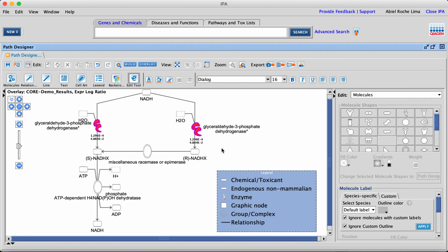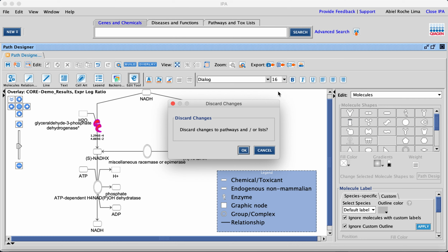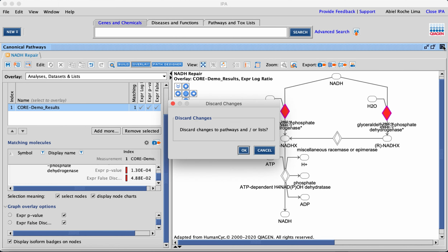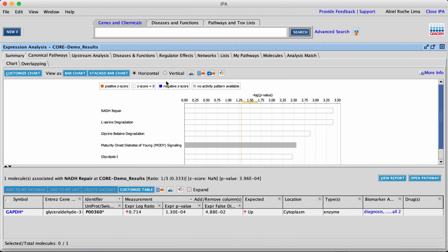So that is only, and most of this information is only extracted from a single tab of the main results page. So let's just close this in here. Let's close this as well. All this information that was shown to you is from one single tab.